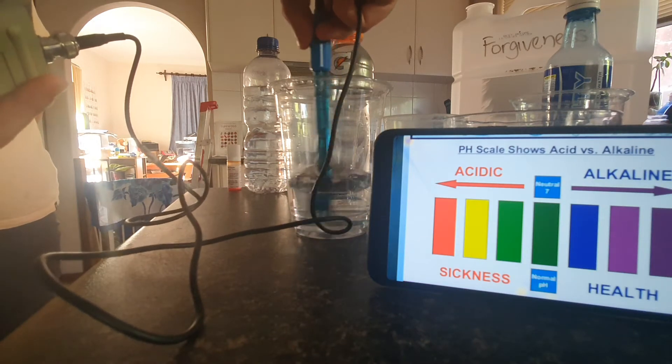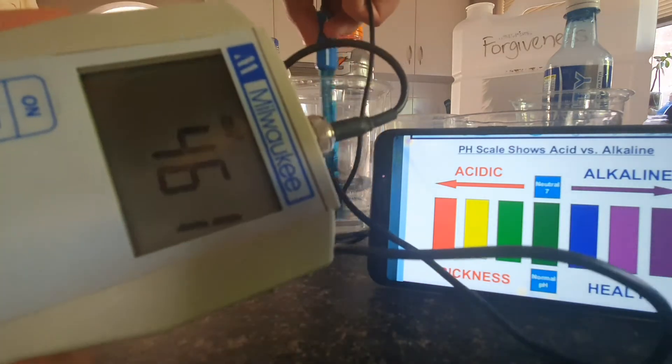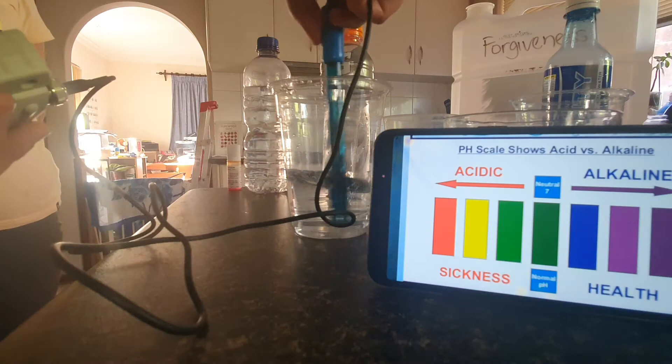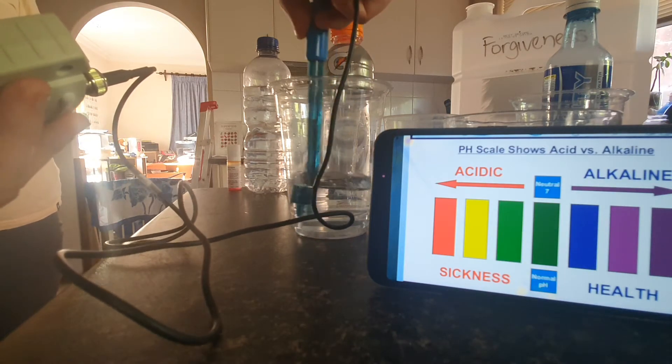You can see it. And that will start going into the negative. Had we calibrated the device, that would already be like negative 800. It just takes a little while to catch up.